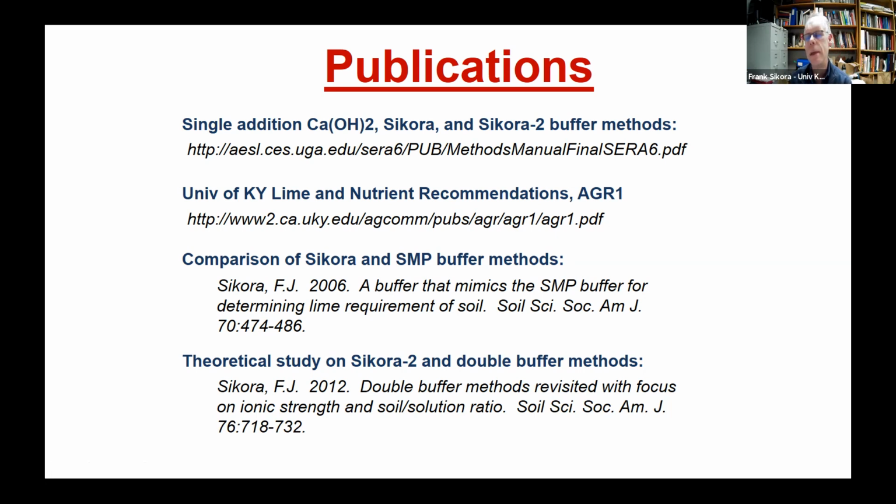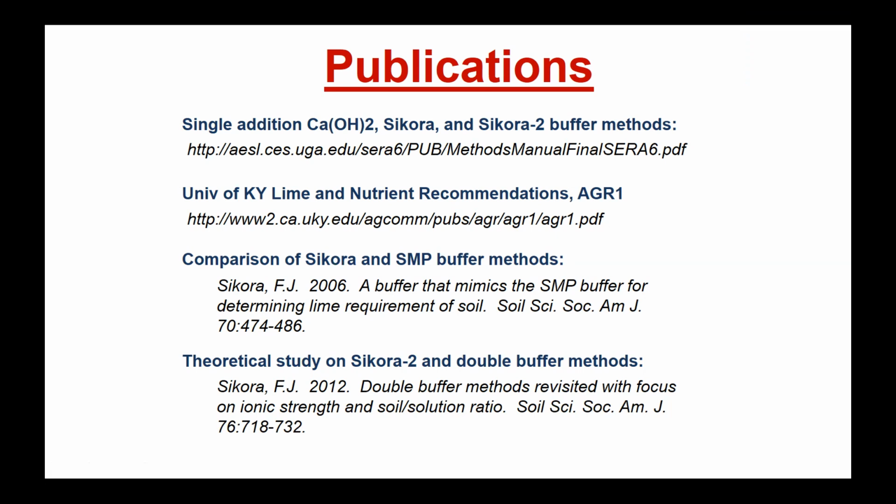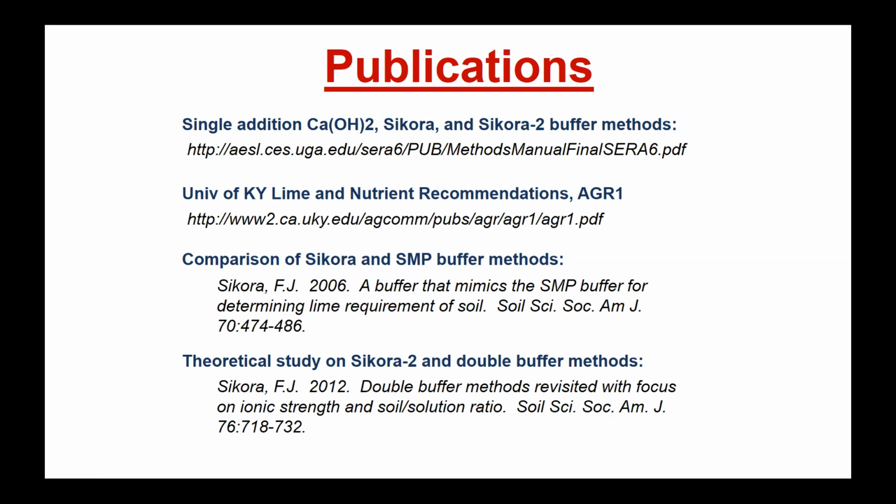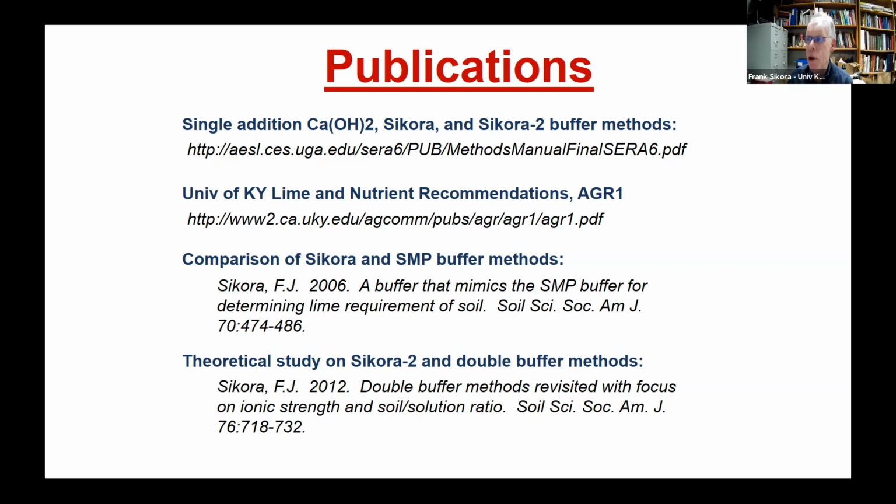Hey, Frank, this is Rao from Florida. Quick question. Is there any ionic strength issue with the AE buffer that we have to deal with? I don't know. I didn't look at the AE buffer with respect to determining a lime response curve, like with the initial pH.